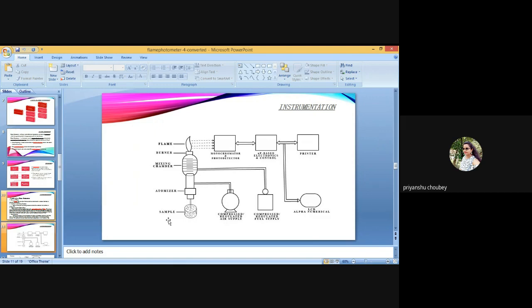If the photocell or filter has lost sensitivity through prolonged use or for any other reason, clean them or get them replaced, and never open them. For replacement of the photocell, contact any competent firm undertaking repair service. Use an automatic voltage stabilizer in the AC supply line.